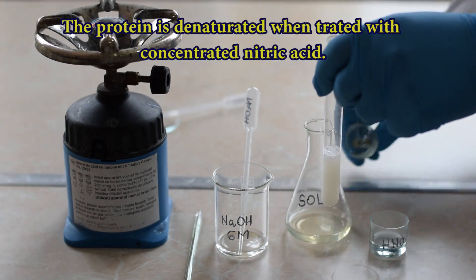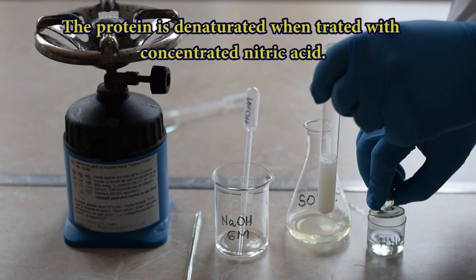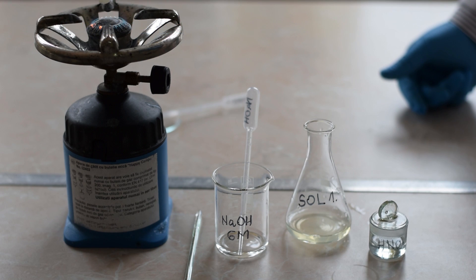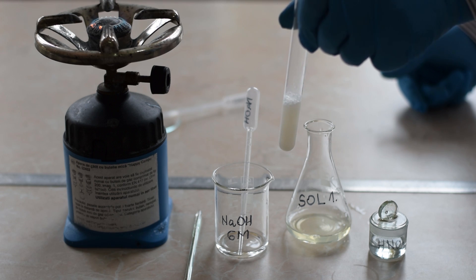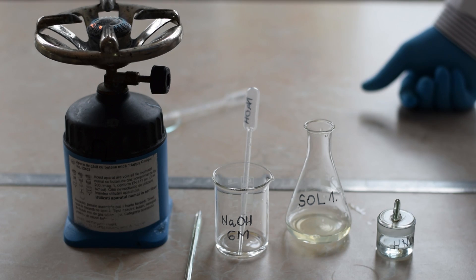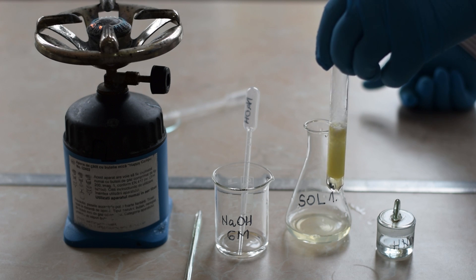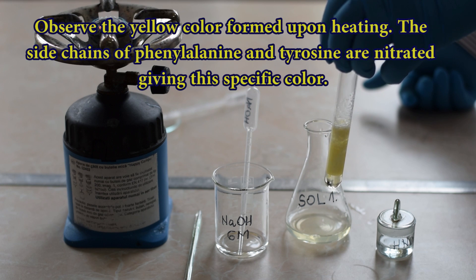Observe the denaturation of the protein when a strong acid is added. Heat gently the content of the test tube. Notice the yellow color that appeared.